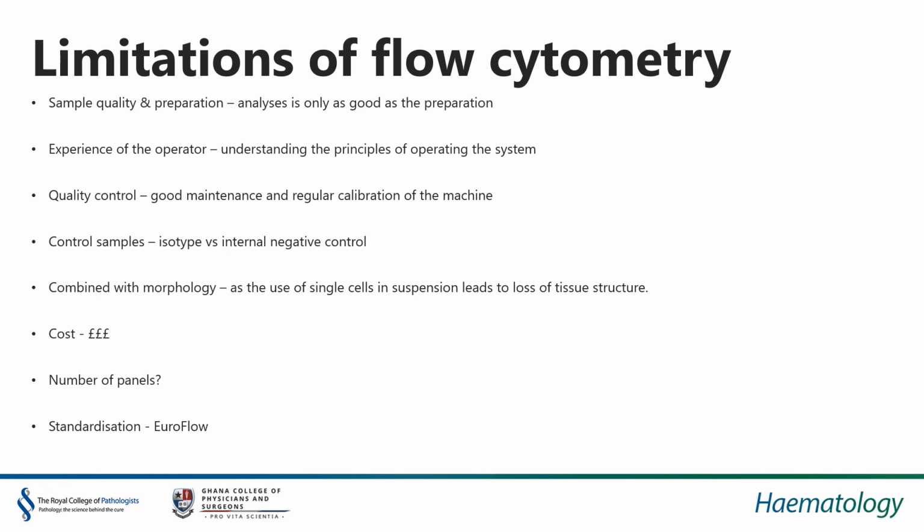And like I said, standardization, whilst we really want some standardization for flow cytometry, and really the Euroflow group has been leading on this, laboratories are still choosing to do their own panels and picking the best bits of best practice guidance.